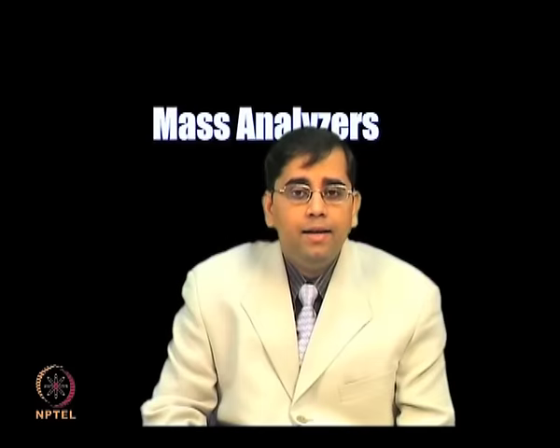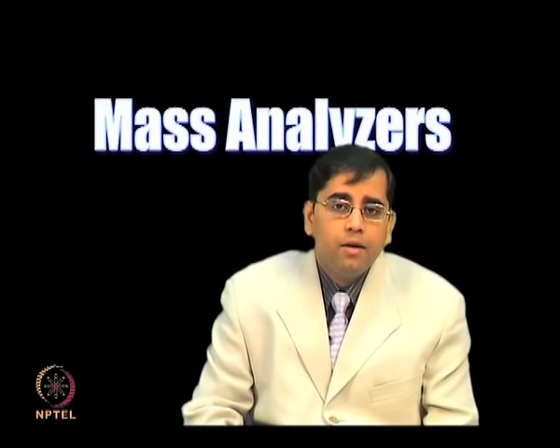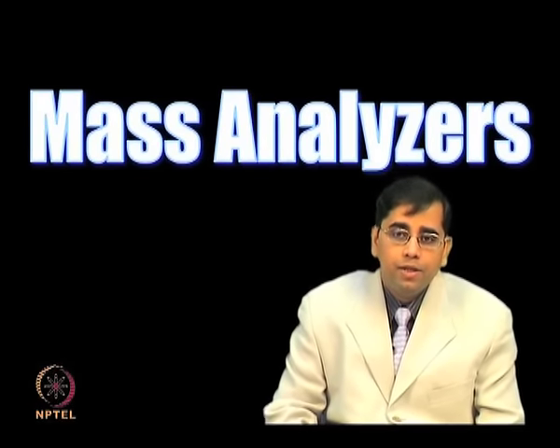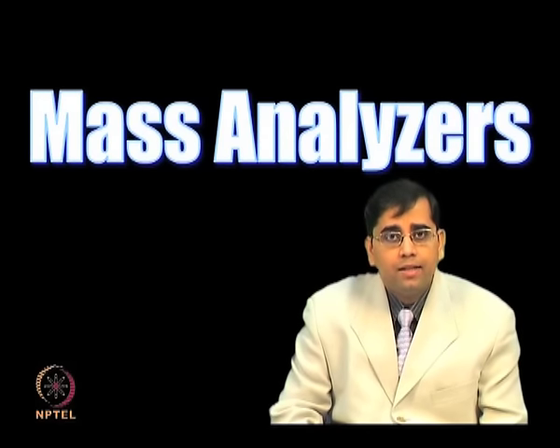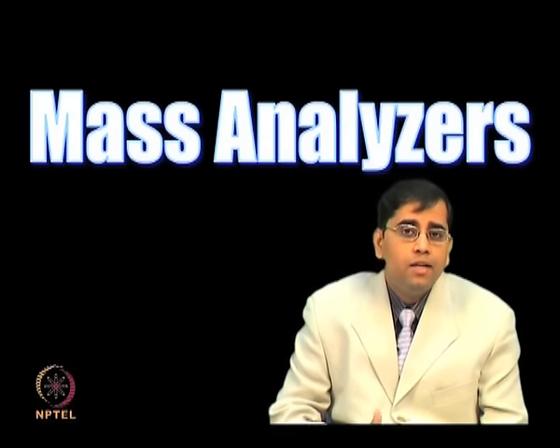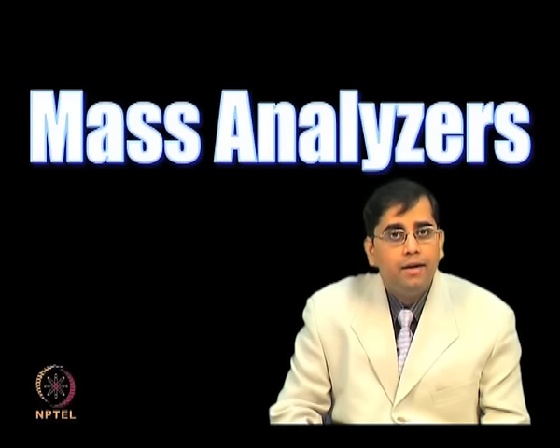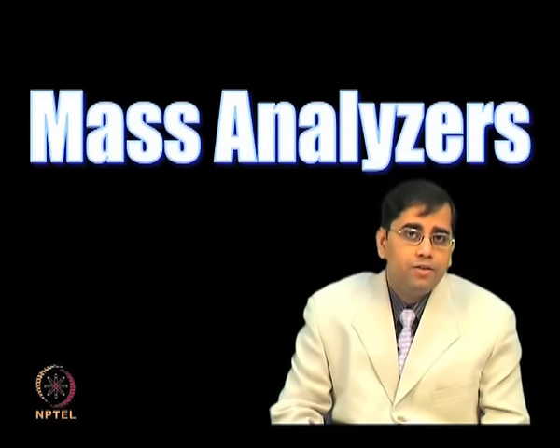The mass analyzer disperses all the ions based on their mass to charge ratio and focuses all the mass resolved ions at a single focal point and maximizes their transmission.